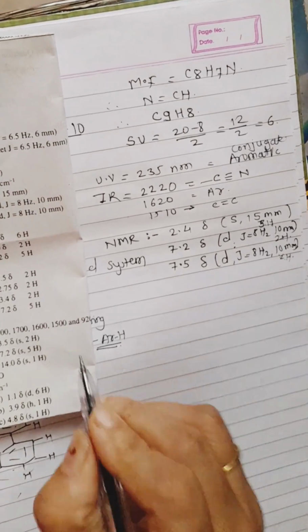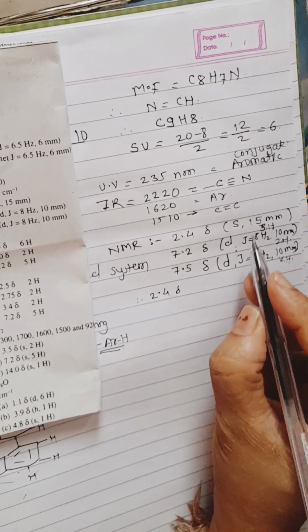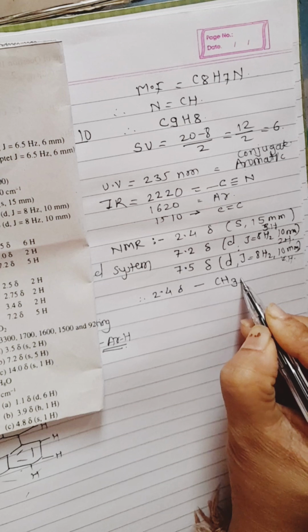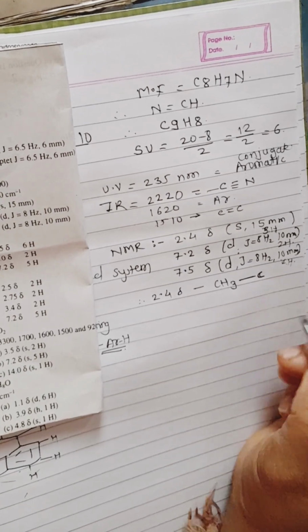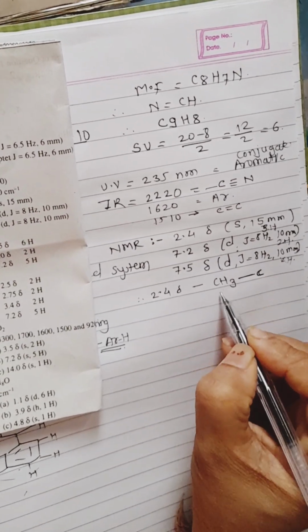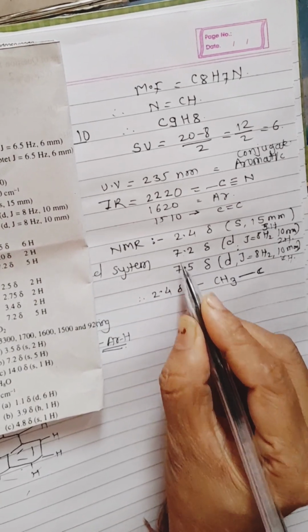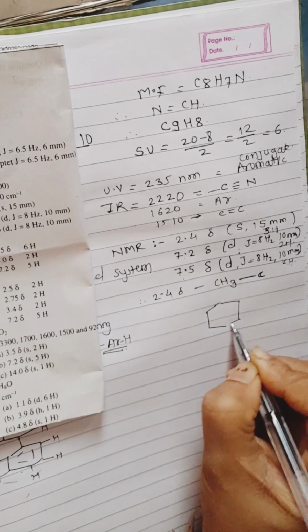Then we proceed to the next: the 2.4 delta, 3 hydrogen atoms showing a singlet, therefore it is the methyl group attached to another carbon atom which does not contain any hydrogen atom, therefore the methyl group shows a singlet. Then 7.2 and 7.5 clearly indicate that there are aromatic protons, but which aromatic protons?